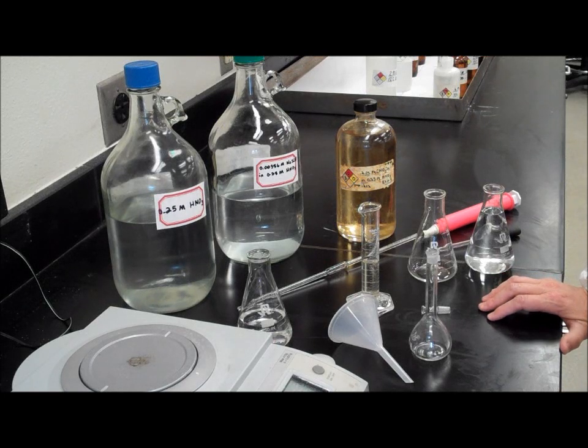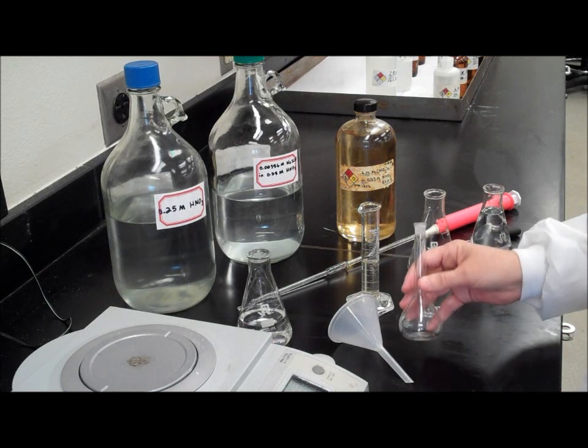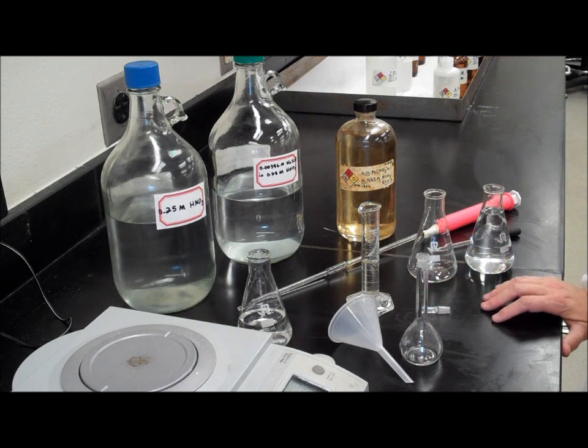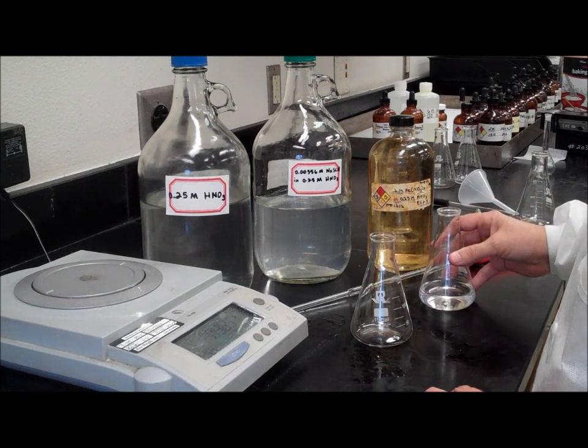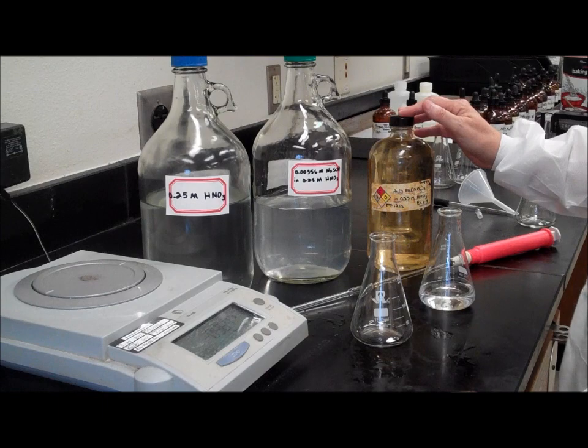In this video, I'll demonstrate how to make solutions 1 through 6 according to the volumes listed in Table 4.1 of your lab manual. You will be using your stock solution of sodium thiocyanate and 0.2 molar iron nitrate.